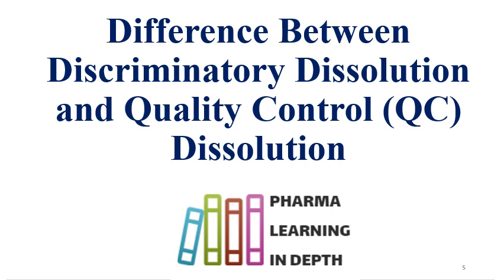Discriminatory power should be there for the quality control dissolution test. Also understand that quality control dissolution parameters are finalized and acceptance criteria for the QC testing is finalized based on the bioequivalence batches and clinical batches.